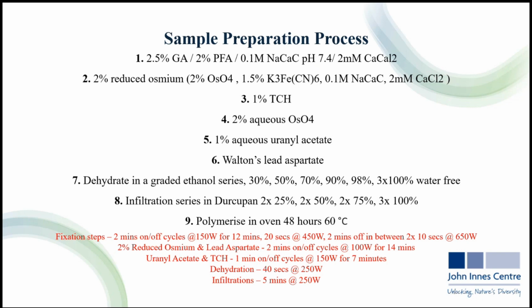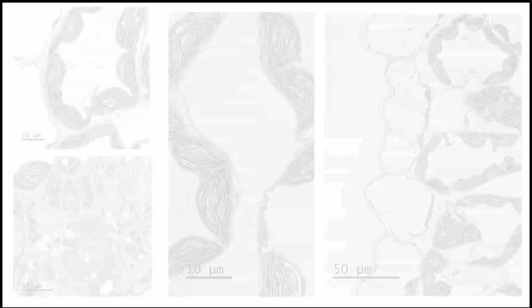What I've put here at the bottom, I've just highlighted some points of how quickly some of these steps will be. So the fixation steps could take no longer than 14 minutes, and for the further staining steps, 14 minutes, 7 minutes. So it's a very, very quick process compared to our manual protocols that we would use. And after trialing this out, these were the results.